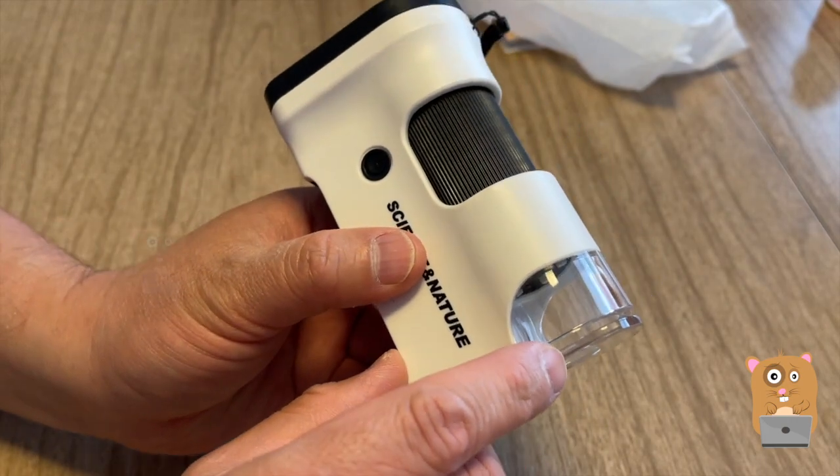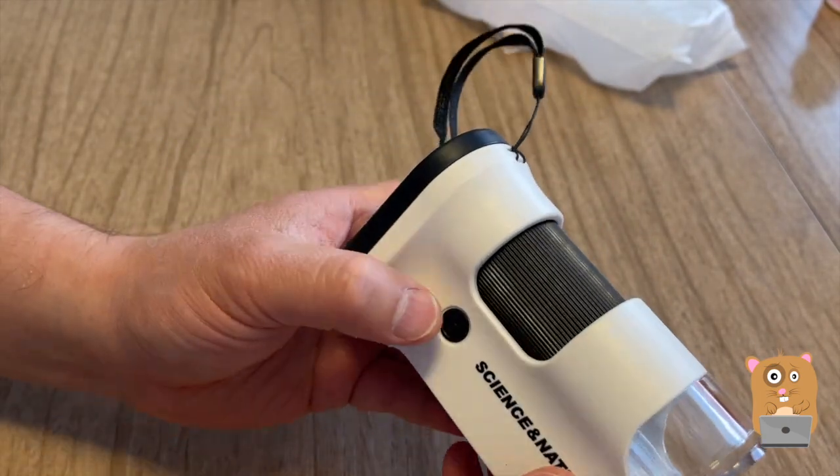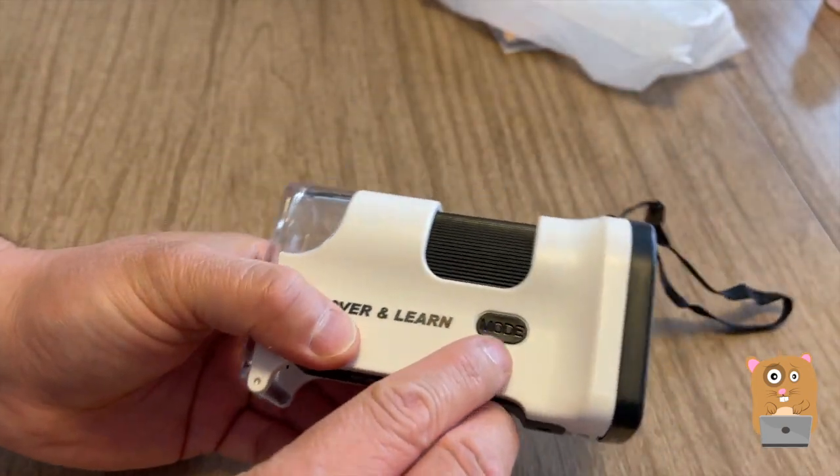The slide goes right in here. There's the power button, focus ring, and mode button.